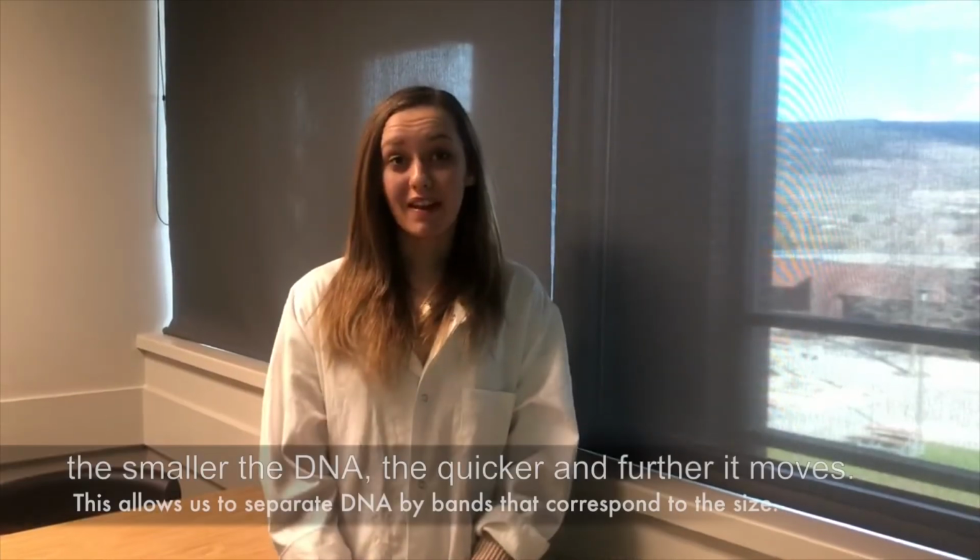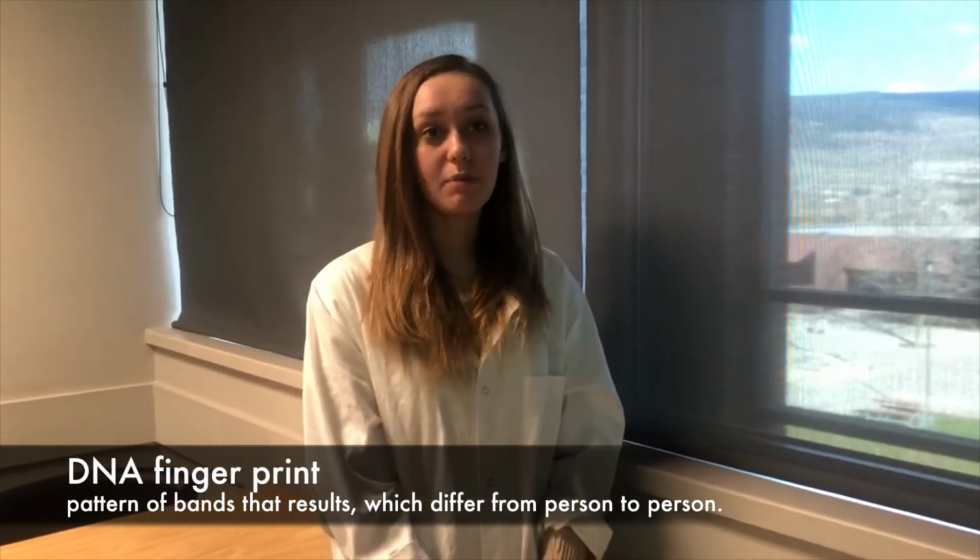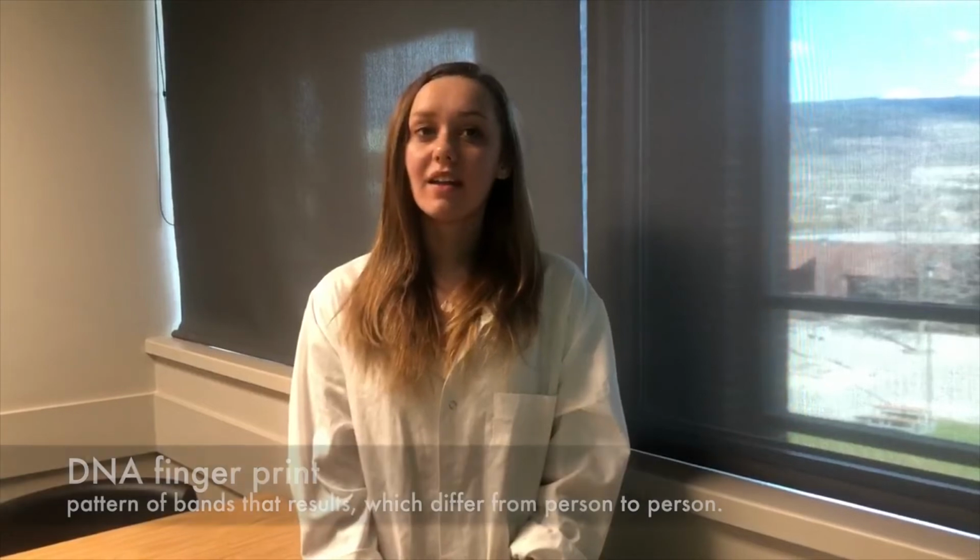So how does this DNA move? DNA moves by size. The smaller the DNA, the quicker and further it moves. This allows us to separate the DNA by bands that correspond to size. So what's a DNA fingerprint? A DNA fingerprint is the pattern of bands that results. Because the sizes and therefore the bands differ from person to person, we can compare the suspect's patterns to the pattern of DNA found to figure out which suspect left their DNA at the crime scene.